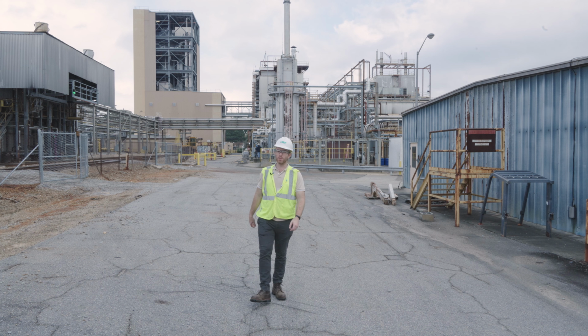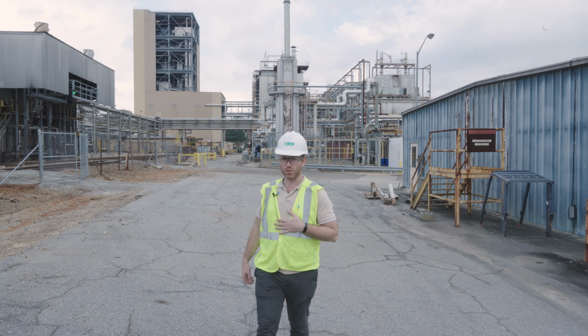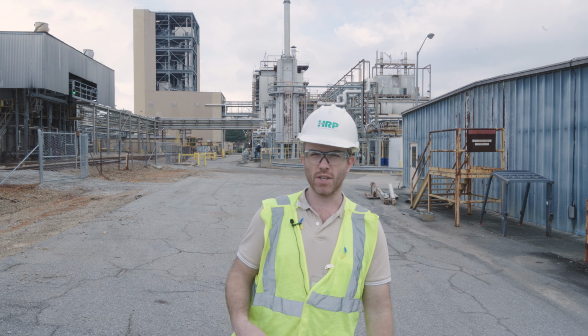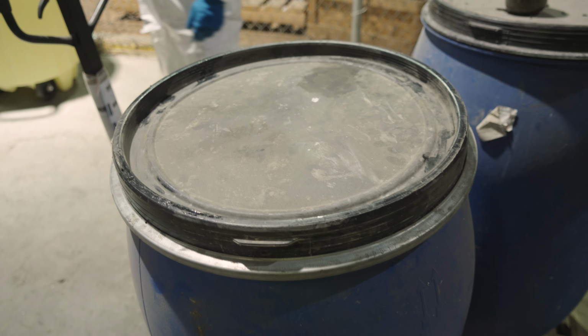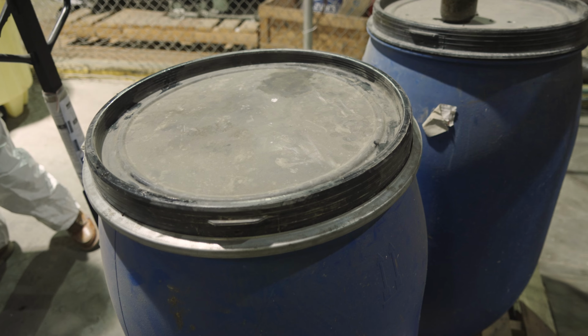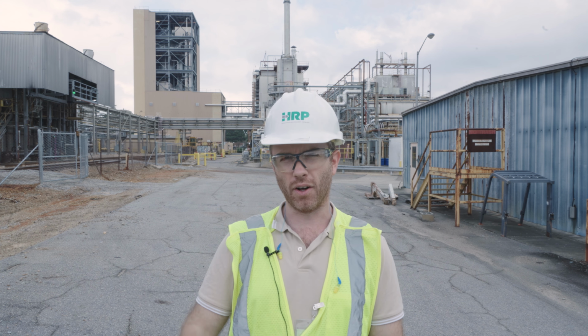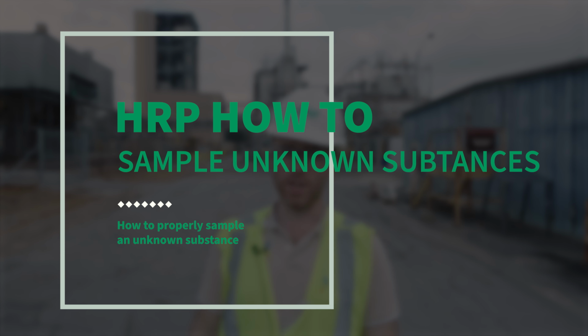Hey everybody, I'm Tom Simmons from HRP Associates, and if you, like our client, are a chemical manufacturer here or a similar plant, from time to time you're going to end up with substances or drums where you don't know where they came from. But you're still going to need to sample those drums and find out what those substances are before you can move those drums or really do anything with those substances at all. And in this video today, we're going to show you how to sample for those unknown substances.